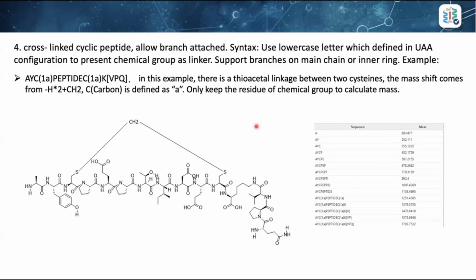We only keep the residue of the chemical group to calculate the mass.